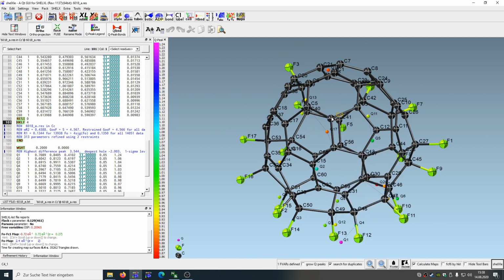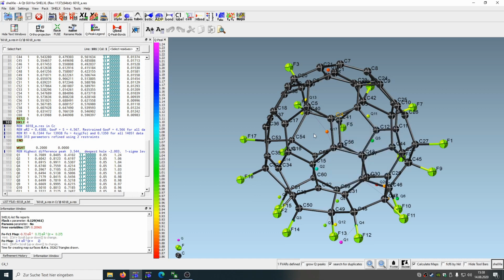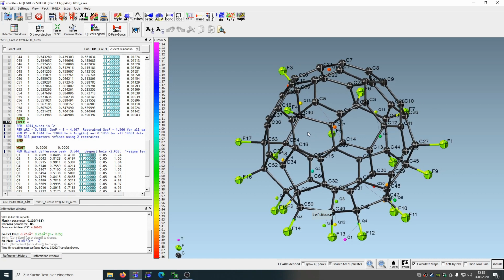Of course, one thing: if you right-click on an atom, you will have a context menu which changes every time, where different options are available or not. So don't expect that you know everything about that menu just by trying once.